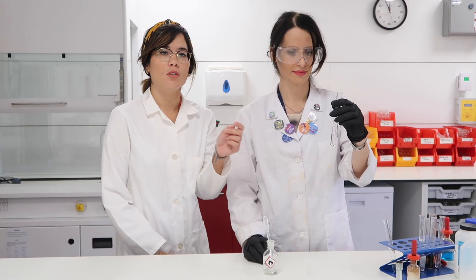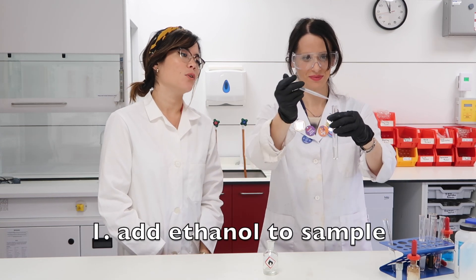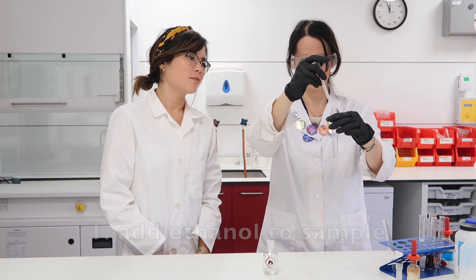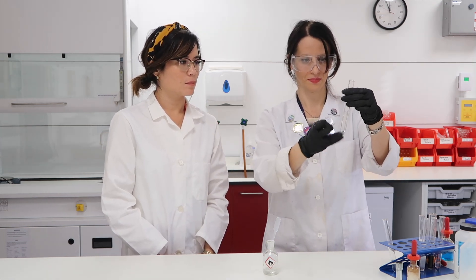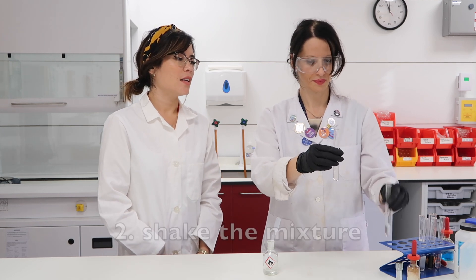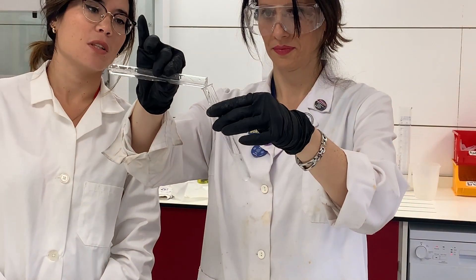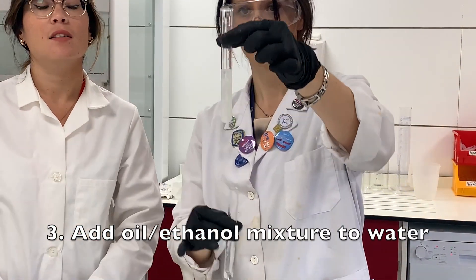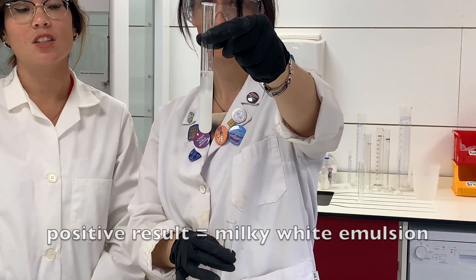You want to start by having your samples — we have some oil in here — and then we add some ethanol to that oil mixture using a pipette. Amelia is just agitating it a little bit, and then the final step is to add that ethanol-oil mixture to a test tube containing some water. Perfect. This is a very nice positive result — we can see a milky white emulsion has formed.